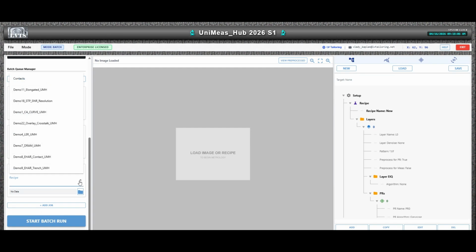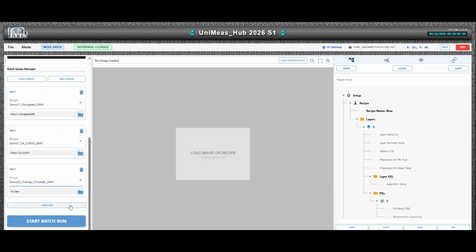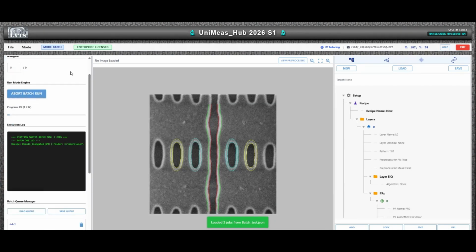As the engine moves from one image to the next, it actively clears the memory. When transitioning to a new pattern milliseconds later, it loads the new template and destroys the previous memory, mathematically guaranteeing that cross-contamination between pattern recognition nodes is impossible.